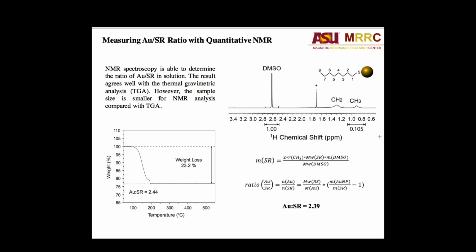So here this slide just shows a very simple tool people can use to determine the surface coverage by using solution NMR techniques. We chose DMSO as the reference to determine the surface coverage for the octanethiol-capped gold nanoparticles. We add a specific weight of DMSO in the solution, and also we weigh accurately the nanoparticles we put in the solution.